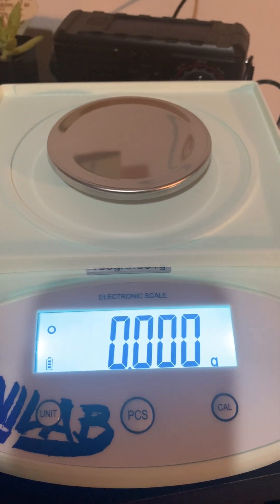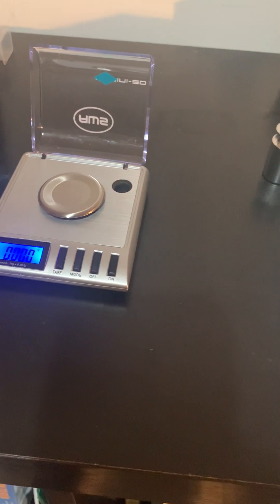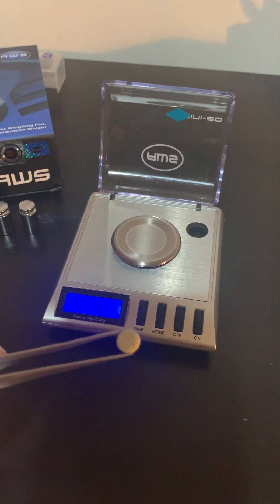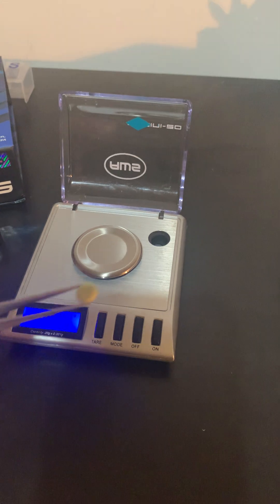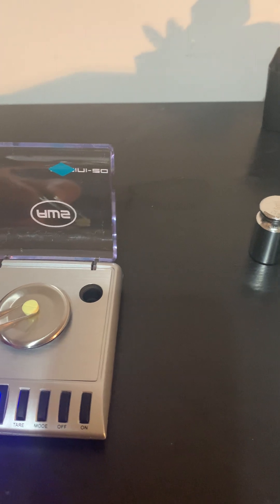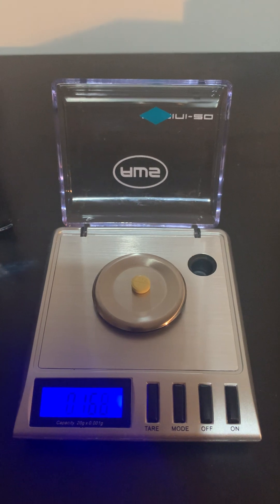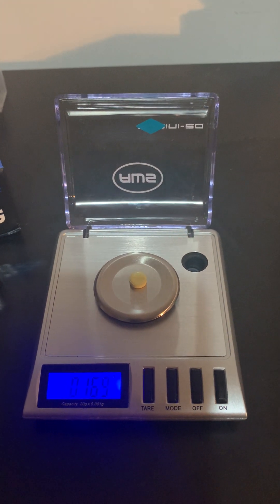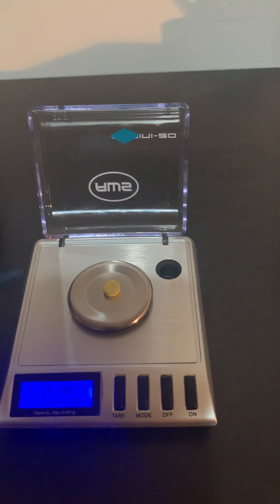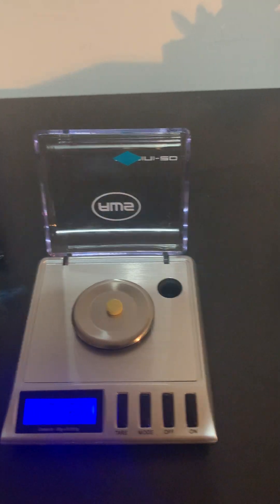Now that they're both calibrated, we're going to test how much it believes one of the pills weighs. Typically these pills weigh around 169 milligrams, which is 0.169 grams — or 0.168 grams. You can see the Gemini 20 got right around that, so I feel confident it's calibrated. Sometimes you'll have inconsistencies, so I recommend weighing three times or weighing another pill if one of the pills seems off.